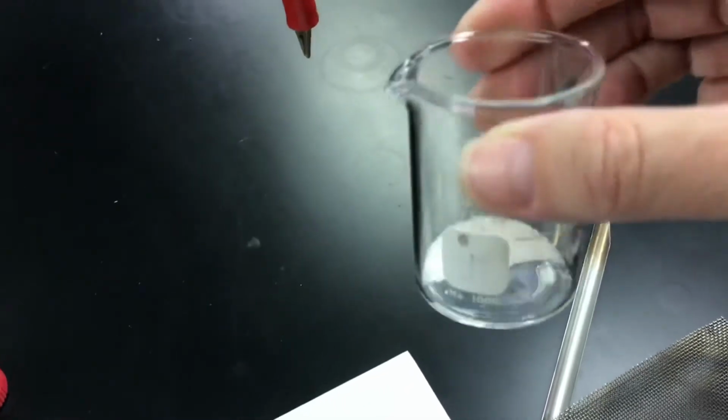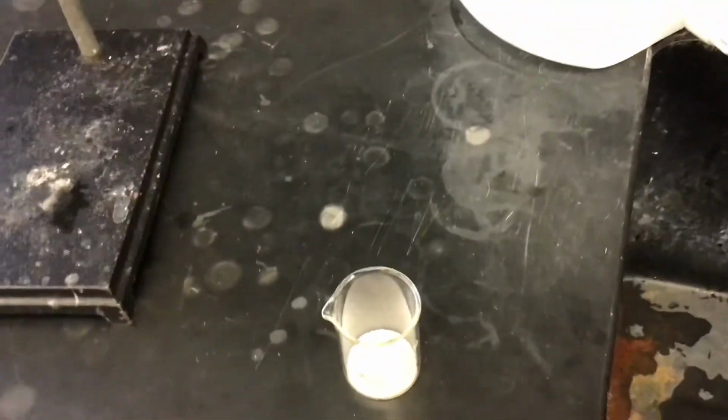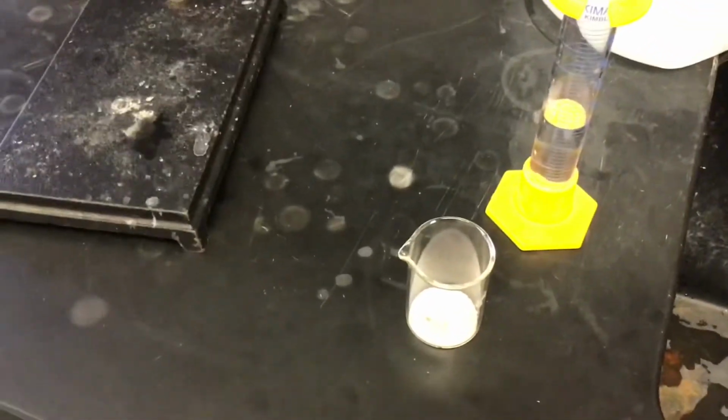So theoretically, everything that's left in this beaker right now should be table salt and sand. So how do you want to separate table salt and sand? The thing that you want to do is add water to it. So that's what I have measured out here. I have a graduated cylinder that I put the appropriate amount of water in. I'm going to add that to this beaker, stir it around with my glass stirring rod, and then I'm going to filter it.